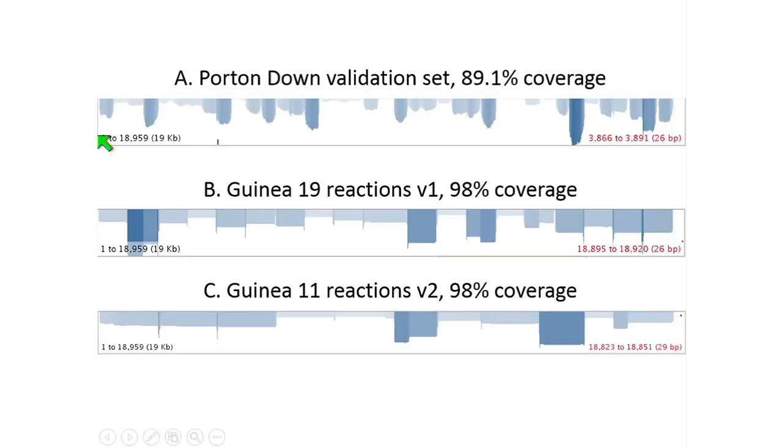And what we found, to our surprise, was that when we tried to validate this initially, we were using very old RNA that was stored, and it was difficult to get products more than about 500 bases because this RNA had been sitting around in the freezer for 20 or 30 years. When we were dealing with fresh material, it was relatively trivial to generate 2 kb amplicons, which means that we could tile across the genome in 10 or 11 reactions and get good coverage of the genome.